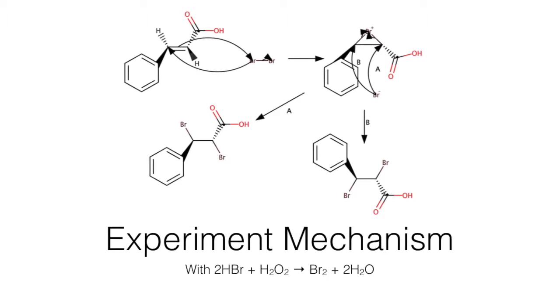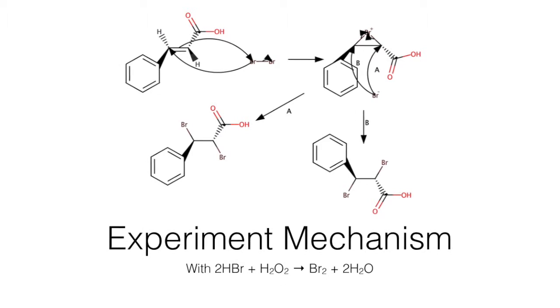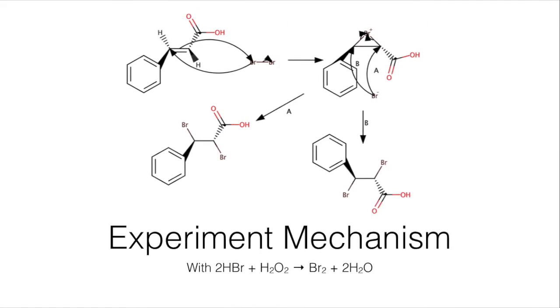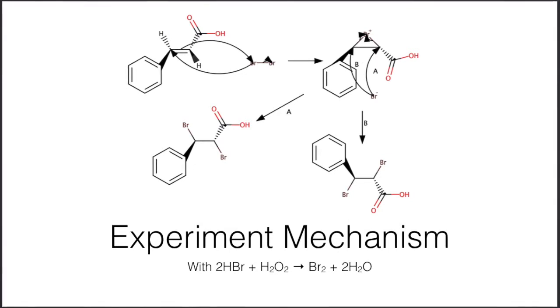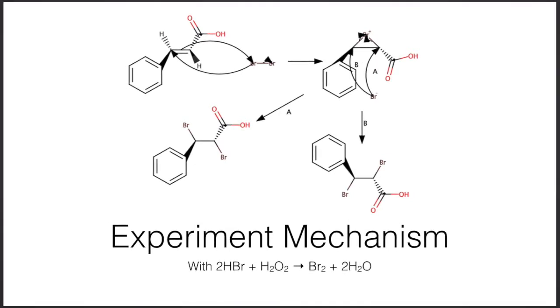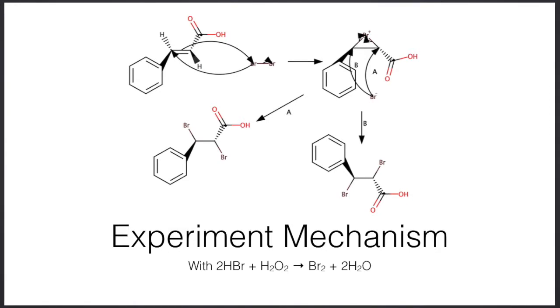Again, brominations such as this and other reactions that result in a product that will be further tested upon are extremely useful to organic chemists. The ability to create your own reactant gives the scientist the ability to oversee and manipulate factors such as reactivity and creation that they would otherwise not be able to control. Further, the development of more green and environmentally conscious reactions is also possible when chemists are able to produce their personal reactants.